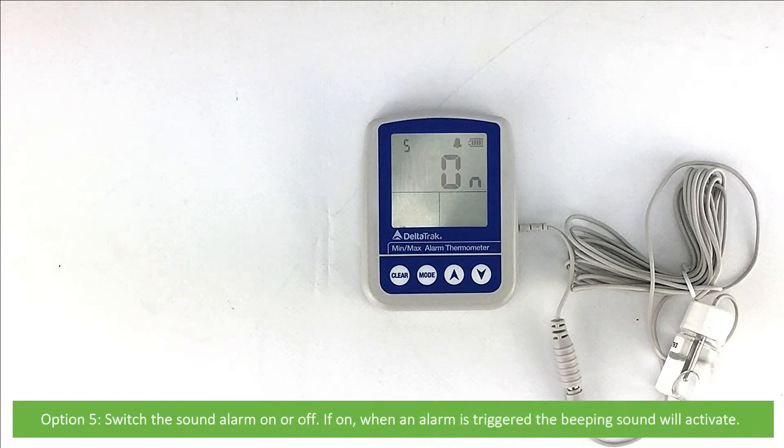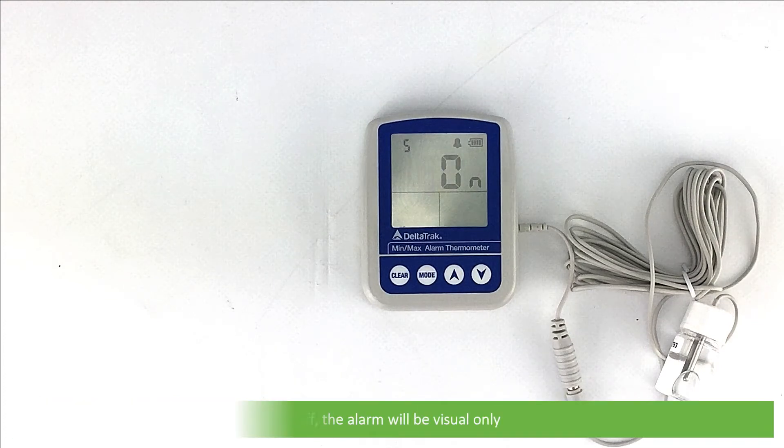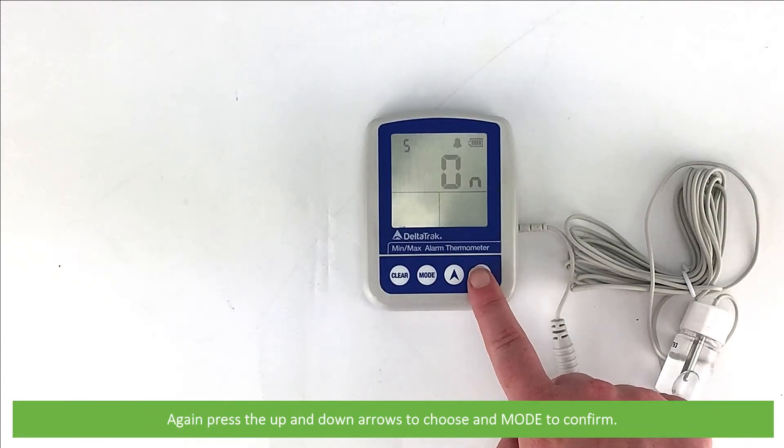Option 5 switches the sound alarm on or off. If on, when an alarm is triggered the beeping sound will activate; if off, the alarm will be visual only. Press the up and down arrows to choose and Mode to confirm.